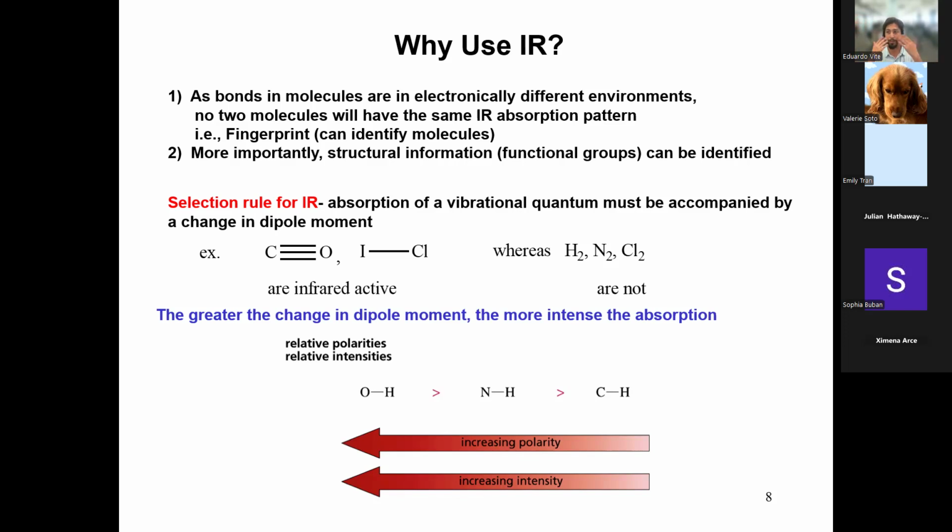So you can actually tell just with your eyeballs if something in front of you, like a red pen, is made out of molecules that have lower energy bonds compared to something that is blue, which has higher energy bonds. But color is one thing we can use, and it doesn't really tell us much more. We use IR specifically because when we're trying to figure out what functional groups a molecule has, just by coincidence, the strength of those bonds happens to match the infrared spectrum. That's really why we do it. If it had been visible light, we would be using visible light. And some do. That's also why we use UV-vis spectroscopy.